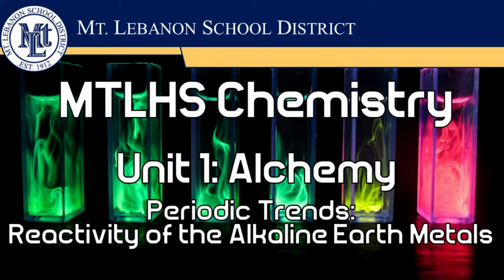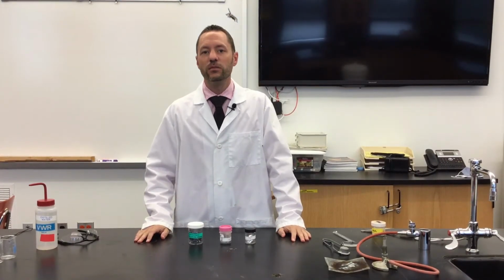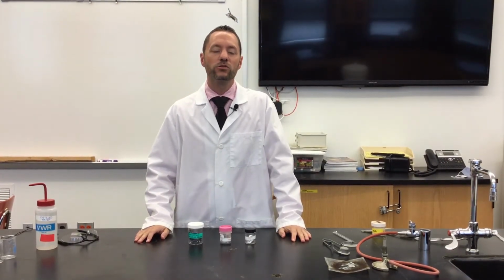There's antimony, arsenic, aluminum, selenium, and hydrogen. Today's lab is about reactivity of metals. We're going to do a little comparing of metals that appear on different parts of the periodic table.